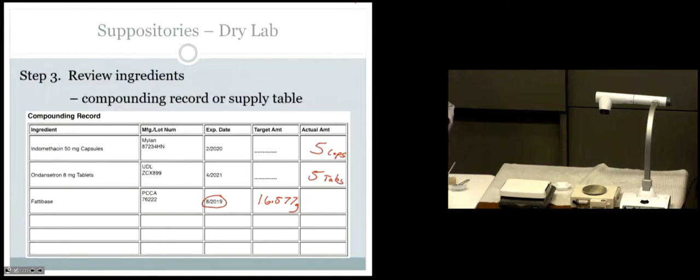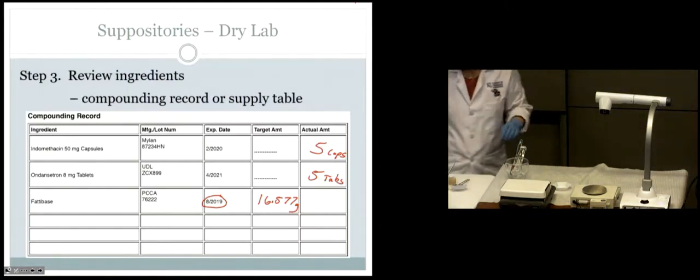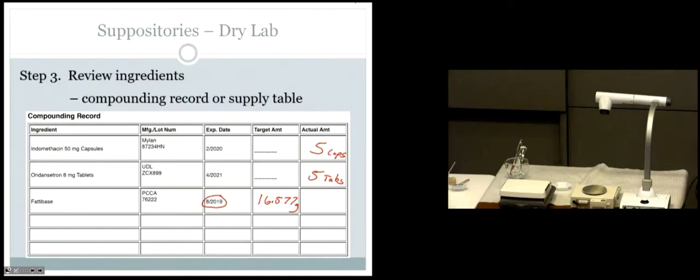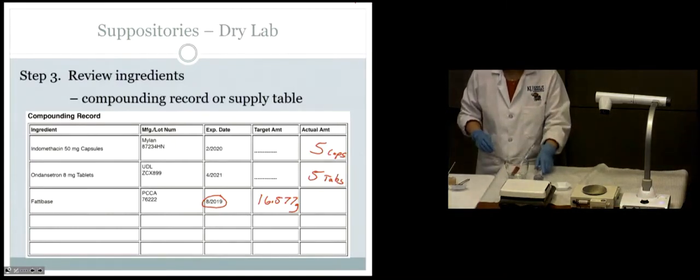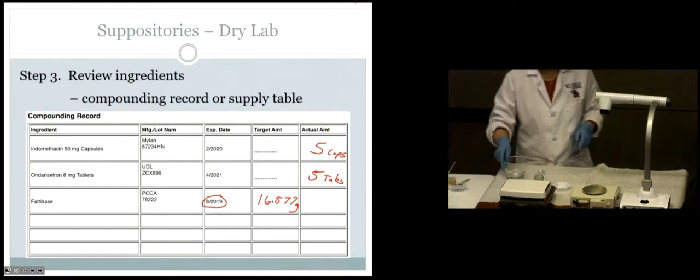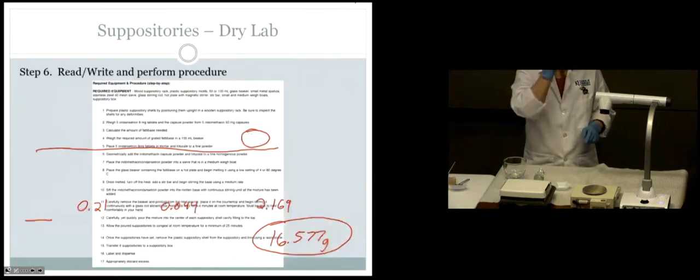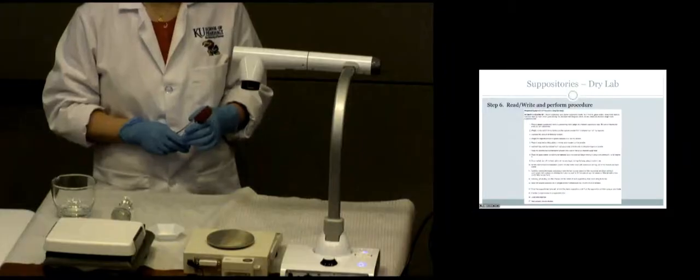How come we don't have another line for each of the tablets and capsules for the amount of powder? Because we're using all of the powder from the capsules and all of the tablets, so we don't need a separate line. We are using 5 capsules worth of powder and 5 tablets, obviously, so that makes a little bit of documentation easier. Everyone okay with that? All right, so now turn to your procedure while I try to get Judy here in 3D.